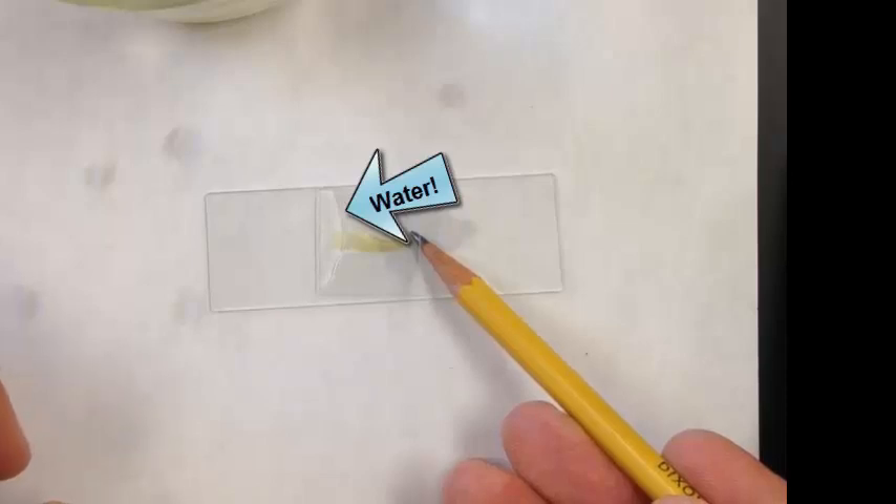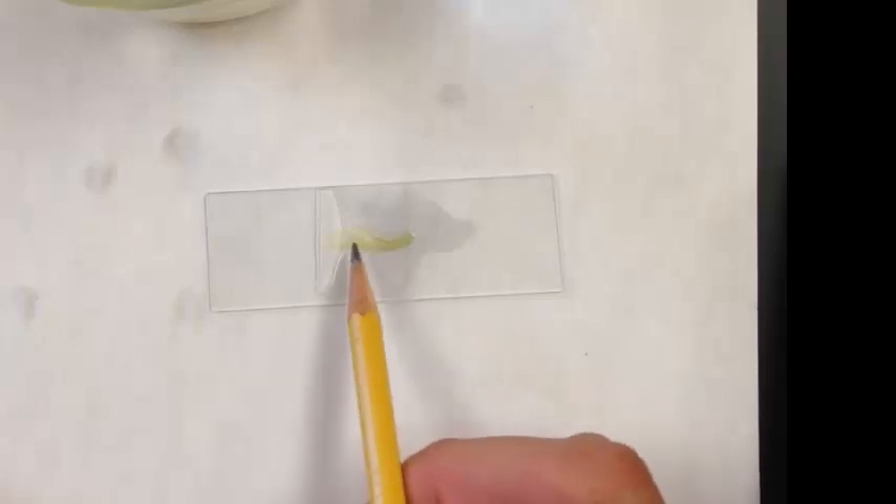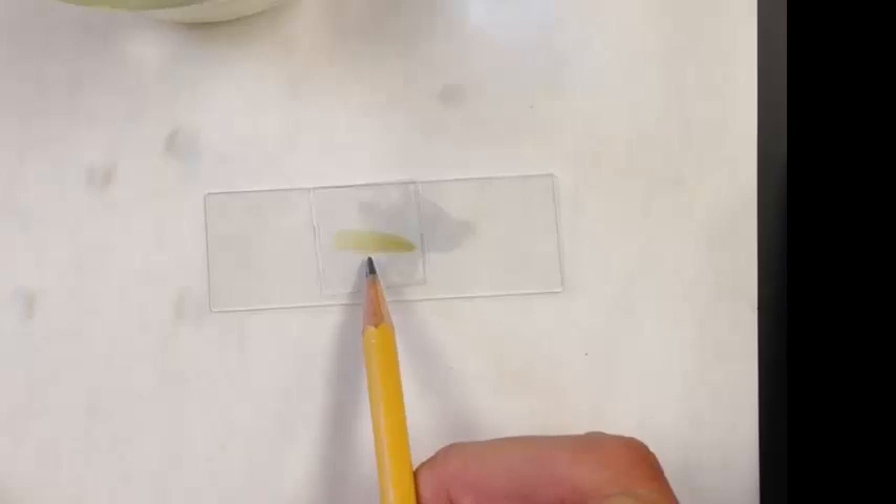Once you get down to the slide, you can then pull your pencil back, and that should help lower the cover slip. But since these leaves can be a little thick, the leaf is actually holding it up. So what you want to do next is just gently with your pencil, push down on the cover slip so you don't break it or crack it, and slowly do that so the air has a chance to escape out from underneath the cover slip.